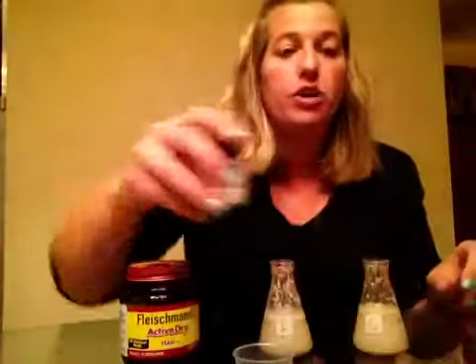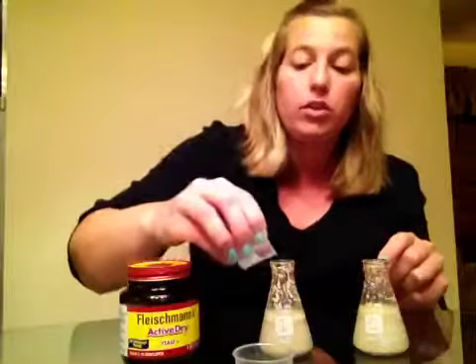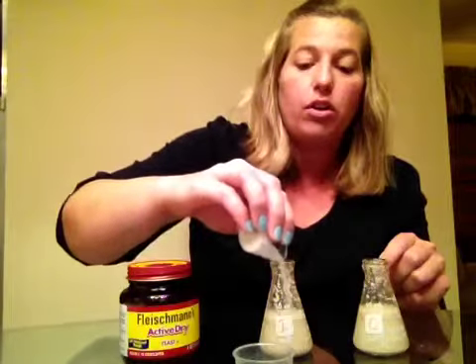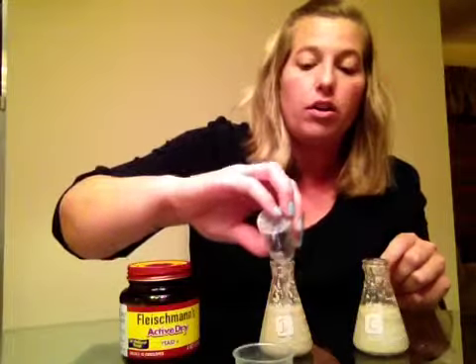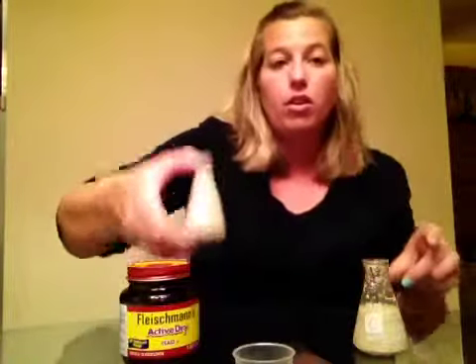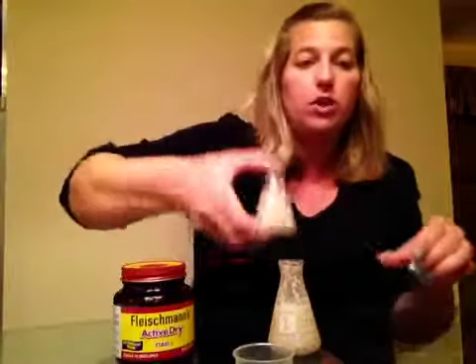And then I'm going to add sugar to my independent variable. That's my test variable. So only sugar goes in my test variable because I'm wanting the process to occur in my independent variable. I'm going to shake it around once more just to be controlled.